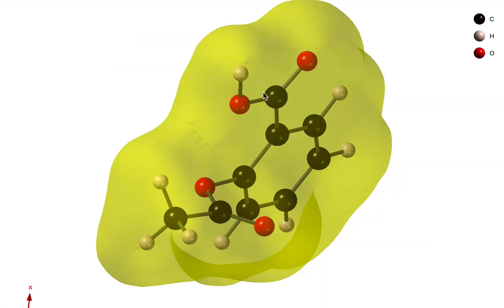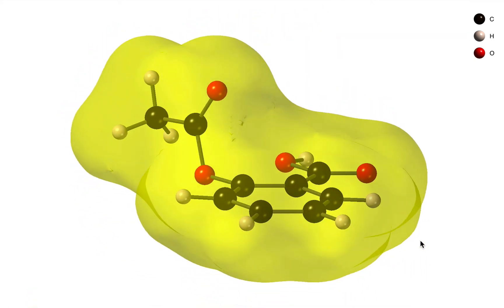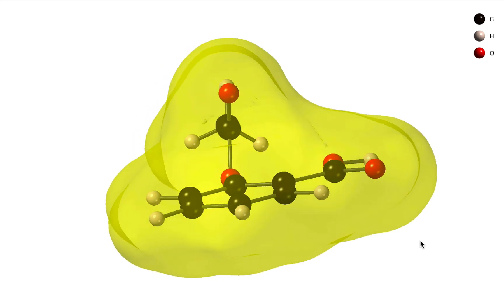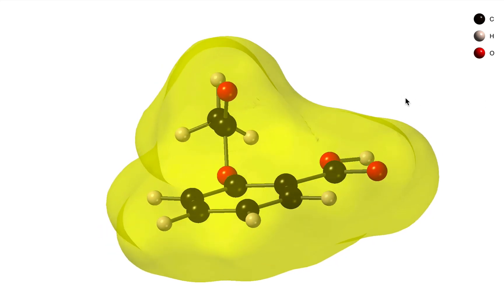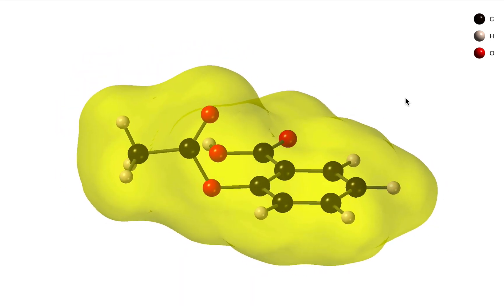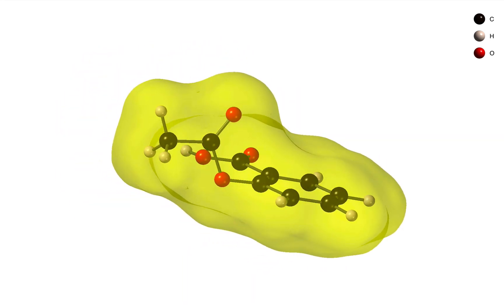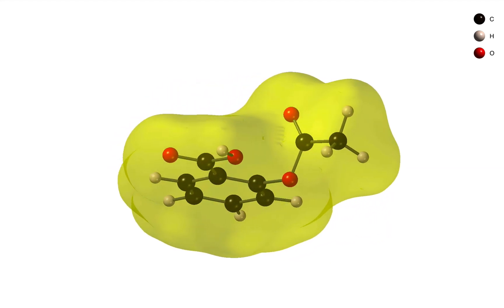Now we have a single molecule with the surface around it. If we need to, we can change the color and other properties of that surface. This gives us a nice combination that indicates the bonding within the molecule but also the overall shape of the molecule.